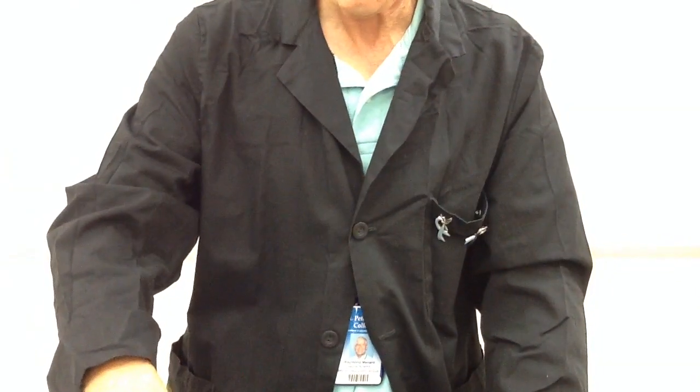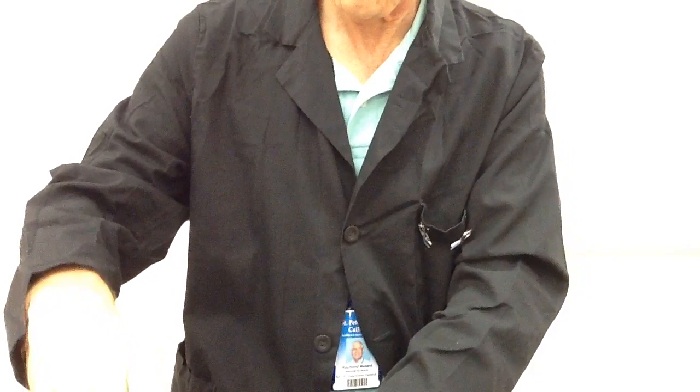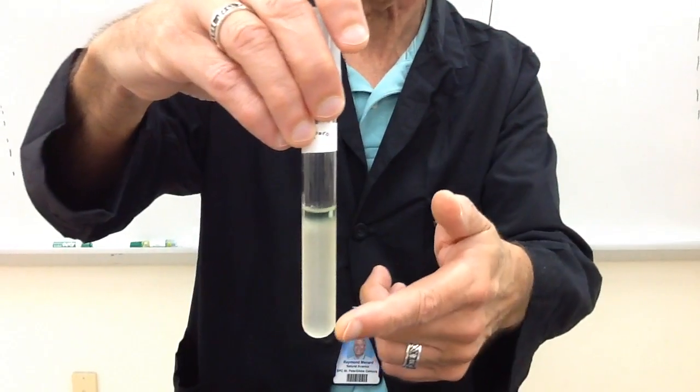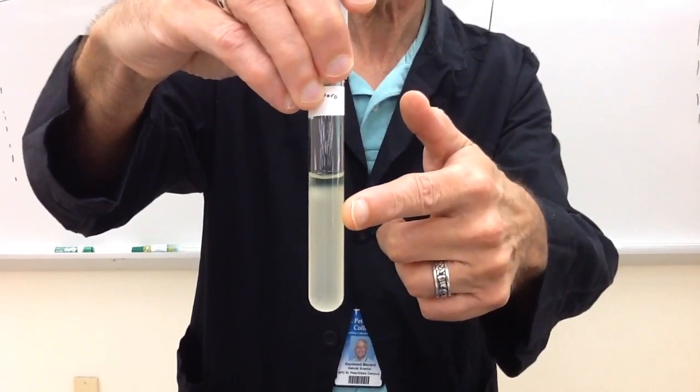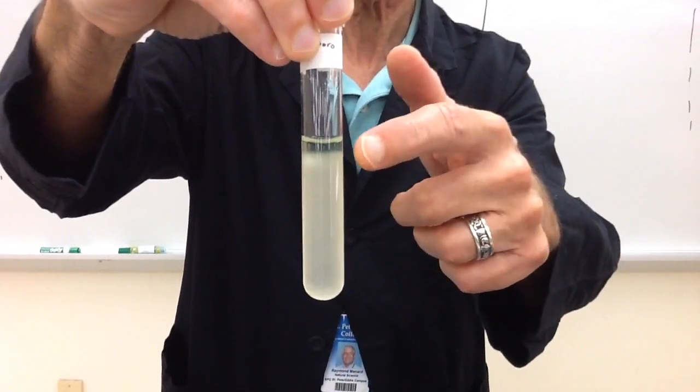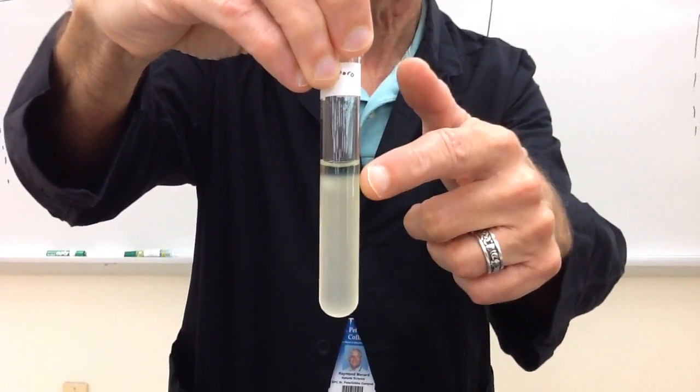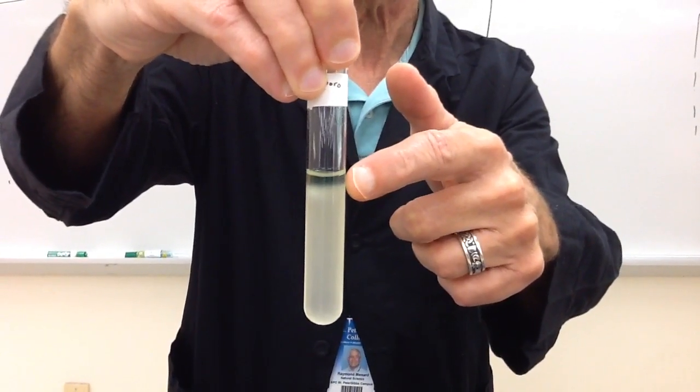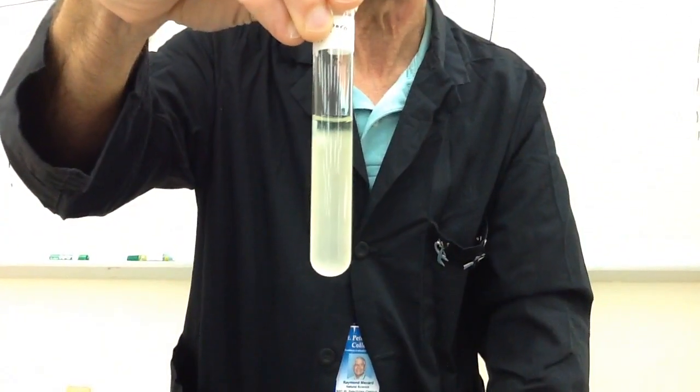Our last one is Clostridium sporogenes, and this one is beautiful. If you take a look, it grows really well down here. If you follow the growth up, you can see this clear area here. That's where the oxygen's at. You can see the green color there, and that's perfectly clear. This is your example of an obligate anaerobe.